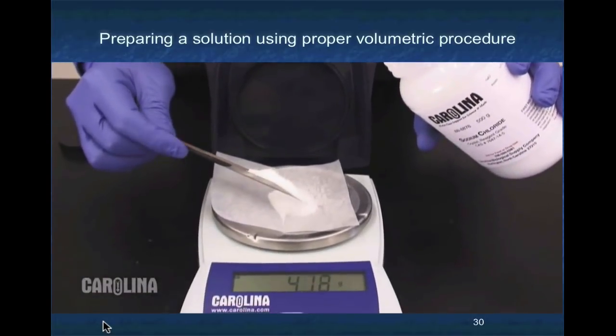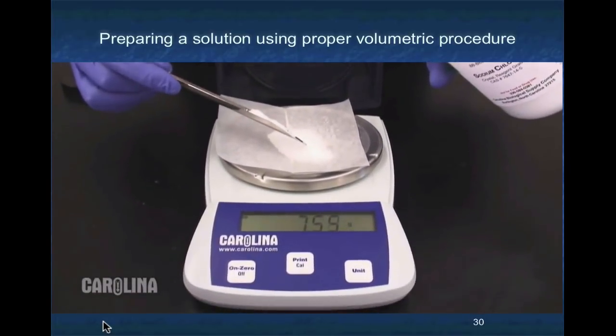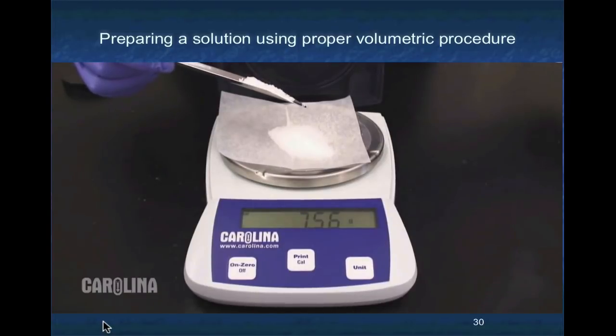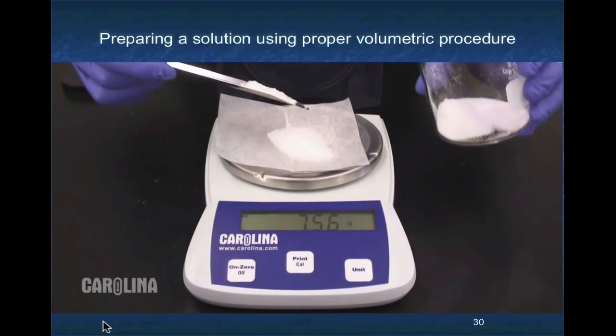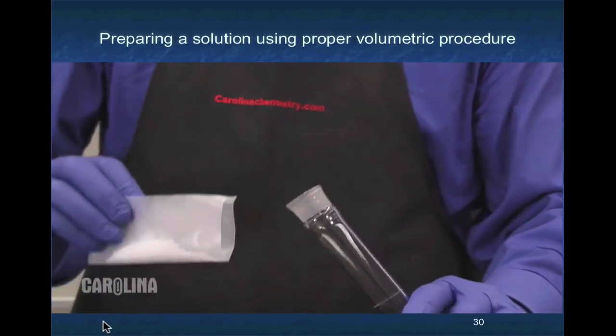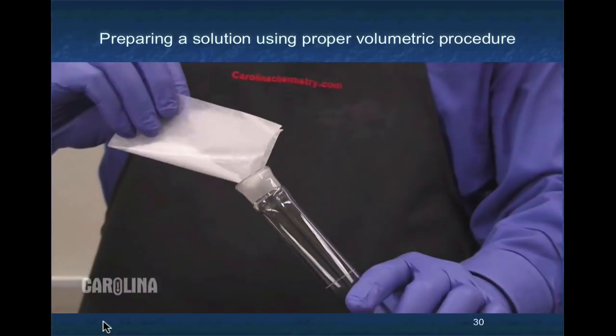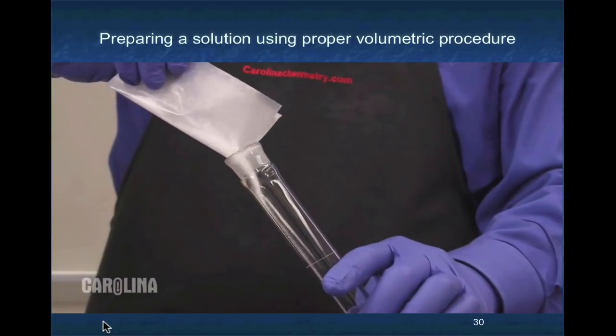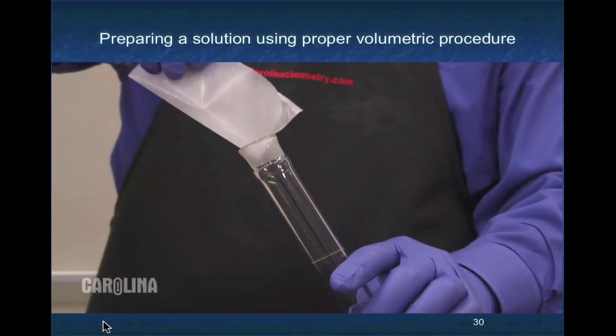Note that if you go over the desired mass, it's never appropriate laboratory procedure to put the excess reagent back into the original container. Always use an additional container to collect the excess. Once you've measured out your solid and recorded the exact mass, transfer all of the solid to the appropriate sized volumetric flask.